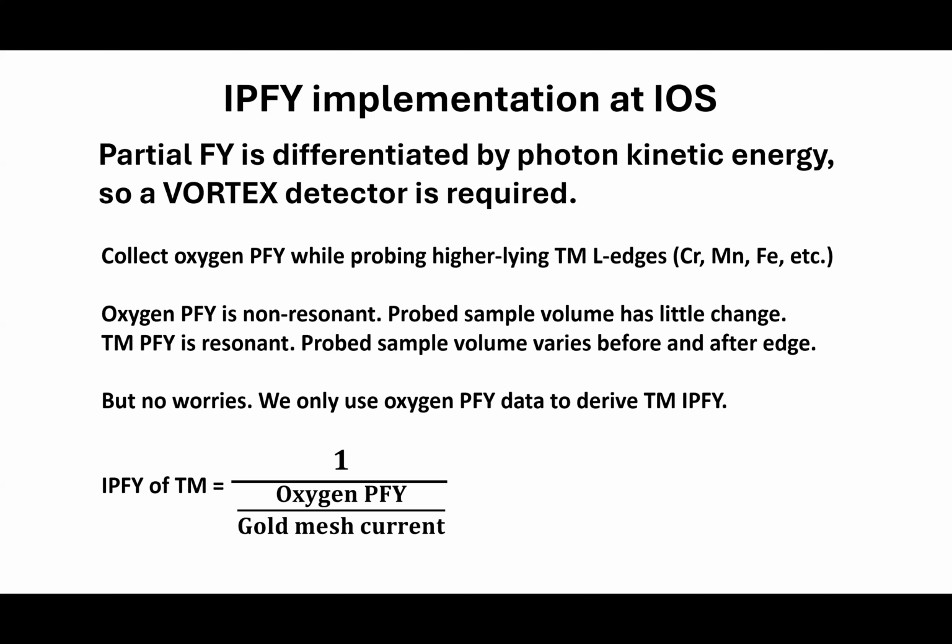And usually this is required when we measure transition metals that are so close to oxygen in energy, for example manganese, iron, and probably chromium. Okay. It's not so much a concern if we go up in energy, let's say we move to nickel. So you do not have any concerns about nickel. The reason is nickel has a much higher energy. Nickel L-edge has much higher energy than oxygen K-edge, right? So you are really generating a very small amount of oxygen non-resonant emission, and that is not much of a concern. And that is also true for copper.